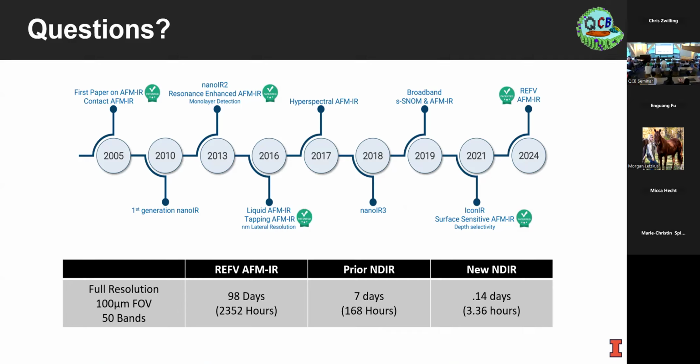Yeah. So I can easily extrapolate how this is used in a clinical question, right? Healthy cell versus diseased cell, or phenotyping. But I have a gap in how one uses it for quantitative cell biology, meaning counting specific molecules. Like what kind of sensitivities are we talking about, how many nanomolar, and how close to species of molecules, protein 1 versus protein 2? Can you give me a sense of what biological or biochemical knowledge gap I can address here, or even not now, but soon.